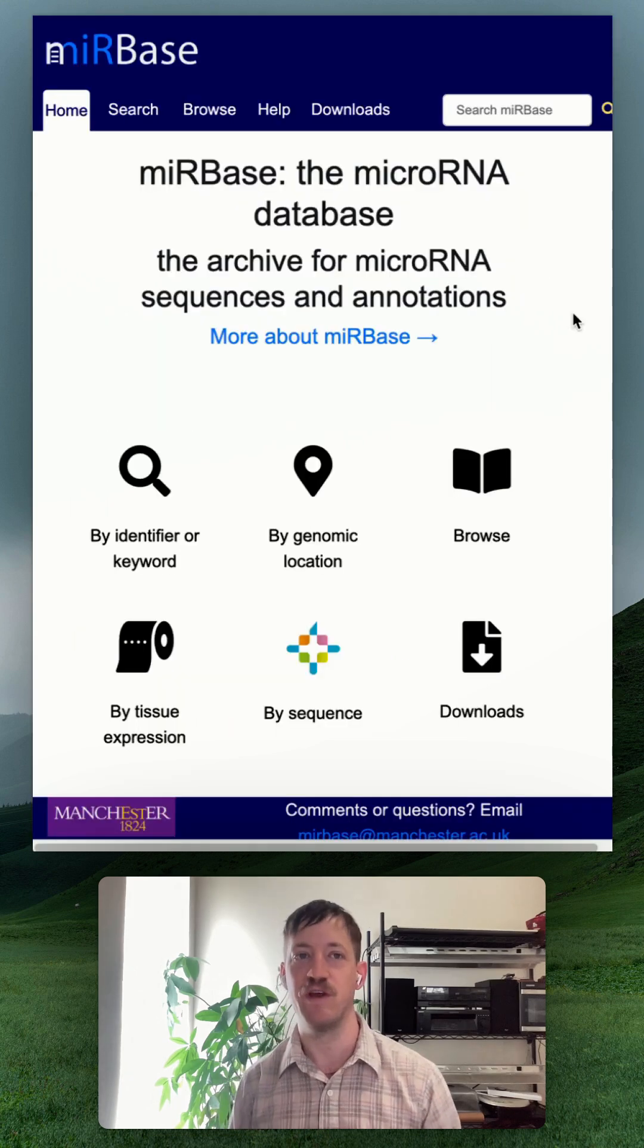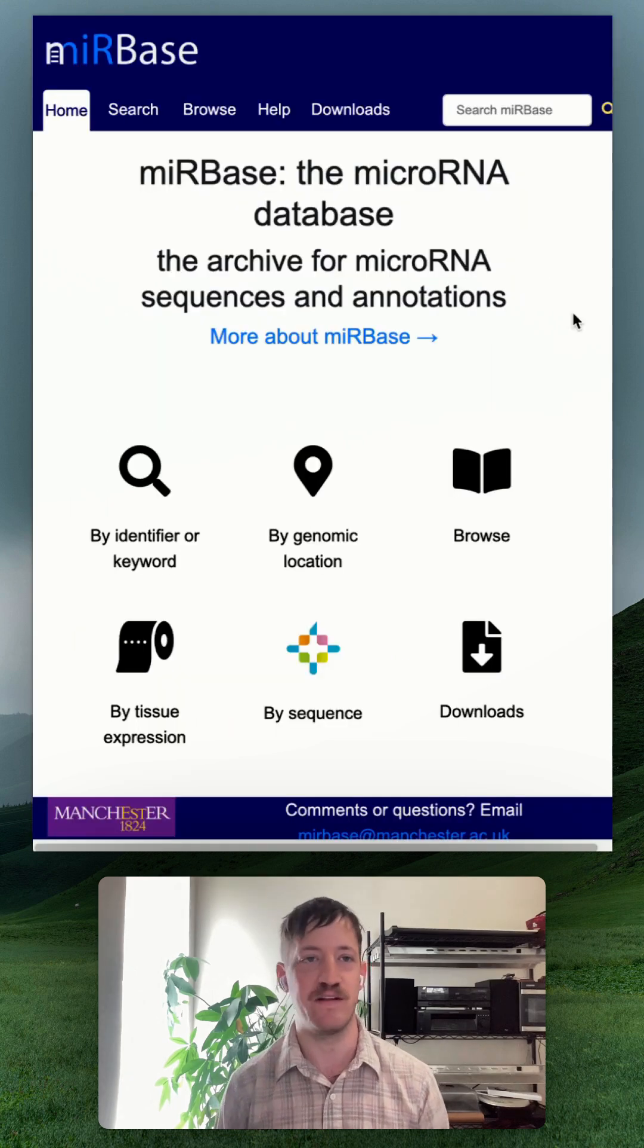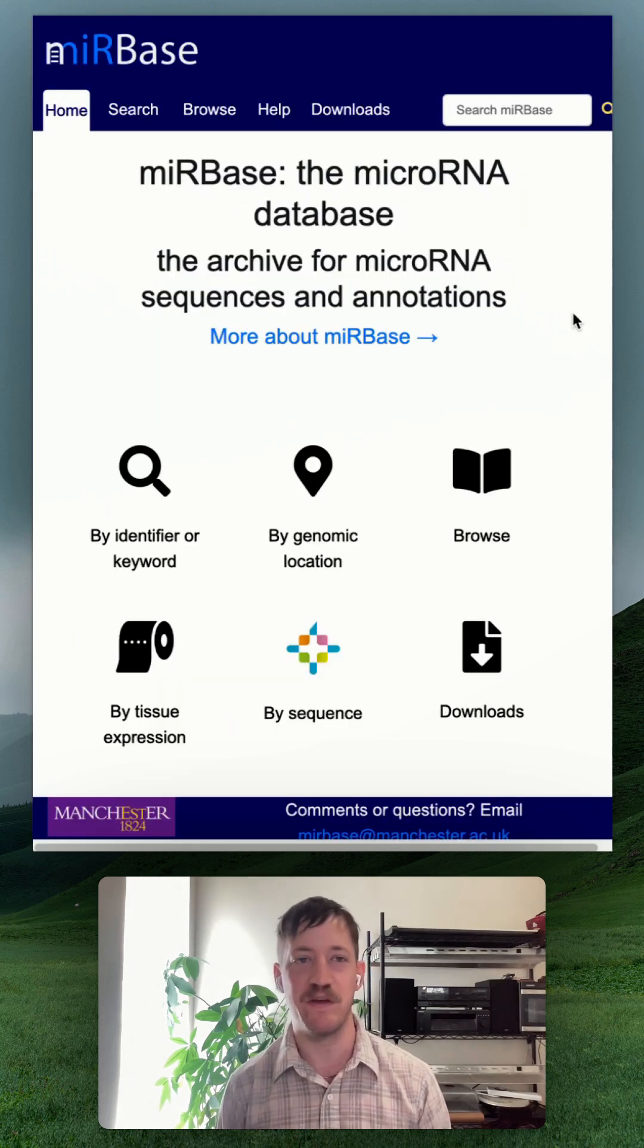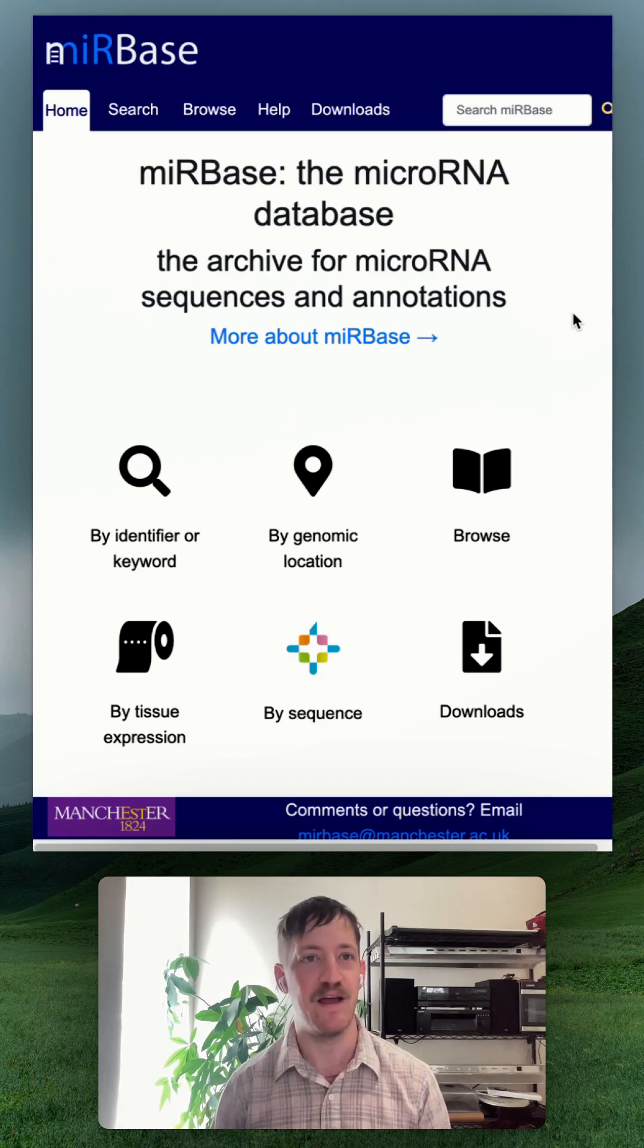This is Mirabase. Mirabase is a great database for fetching microRNA sequences. Problem is, it doesn't have a great API.